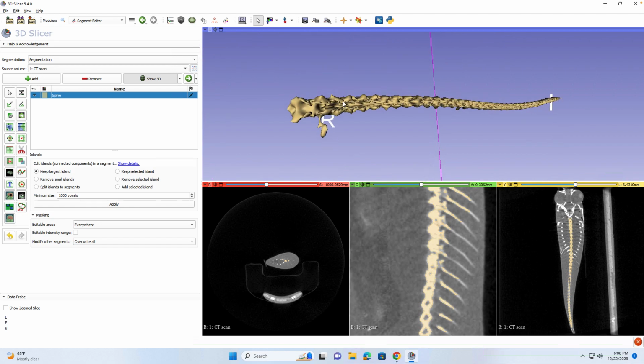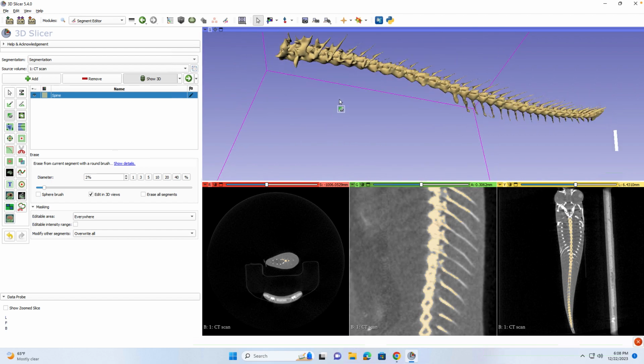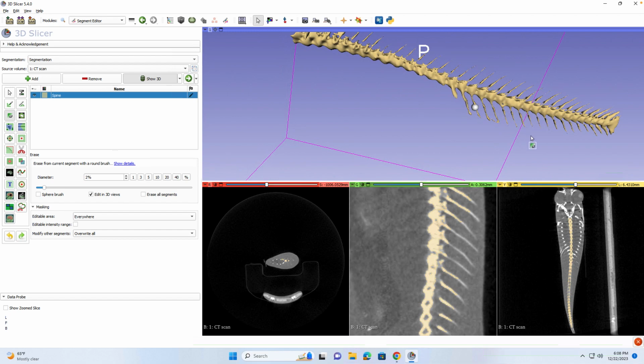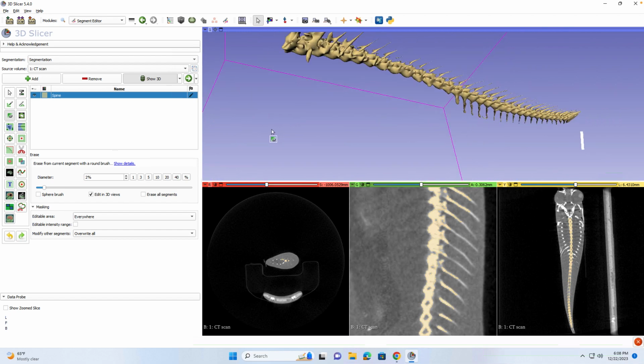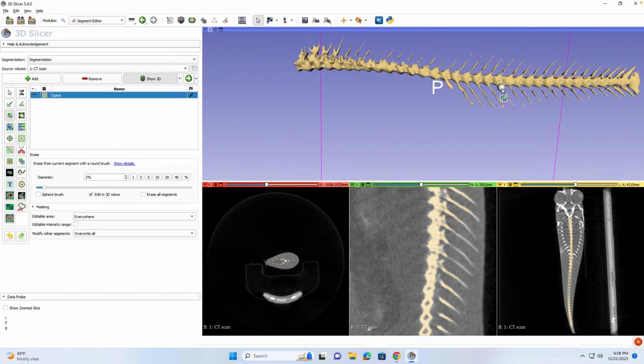Let me see, I need to cut this off. Do that. And then we'll just keep that there for now. So this might be where you want to shoot. All right, so that happens, just do Control Z. It'll go back for you. There's a way you can shift the image as well. Like I'm kind of rotating it on a 3D axis, but it only zooms to the center of the image.